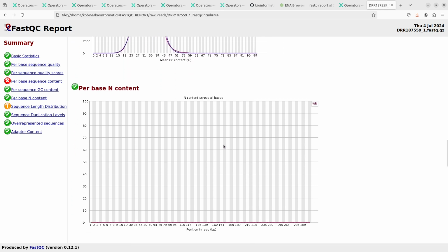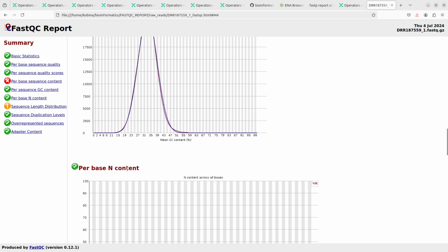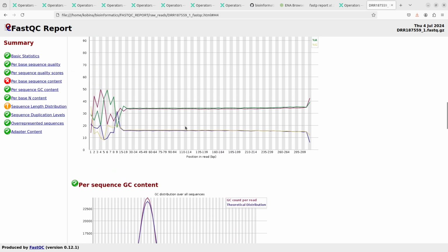Okay, so again, when you check the fastqc page, there's a help page that lets you know how to interpret these outputs, and I've already covered one tutorial of such nature, so you can just check it out and see the possible reasons. So this is a proportion of the bases, the 4 bases. Here we see there seems to be a bias, especially at the start, but there could be reasons and all that stuff, which is beyond the scope of this tutorial. So just take note of that. This is just a quick overview of fastqc.